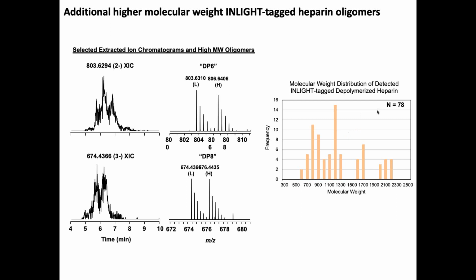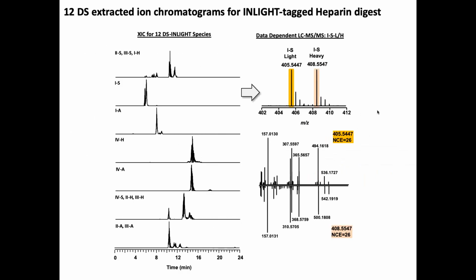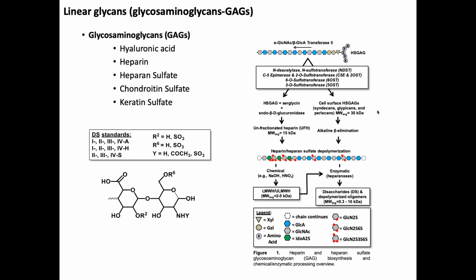And when I'm left with that residual, so if I go back to this, what I end up doing is I chop everything off with my enzyme, and I'm left with this 4-saccharide residue, all right?